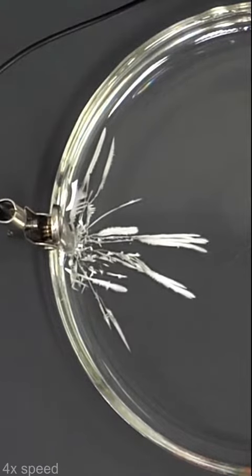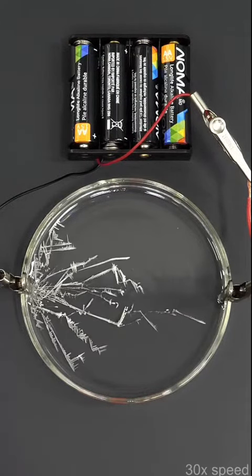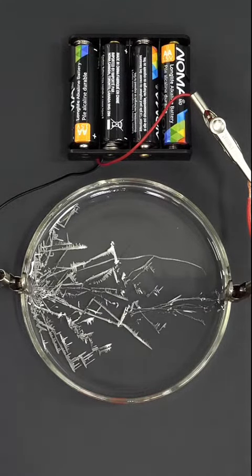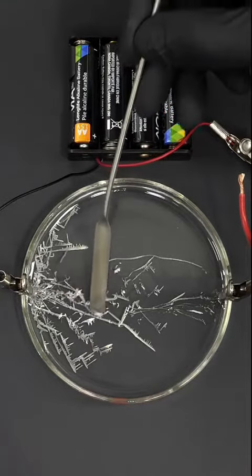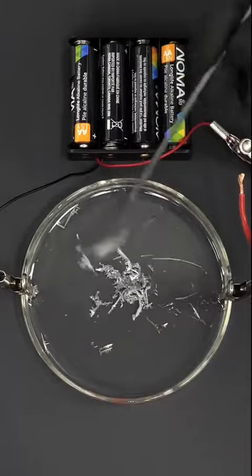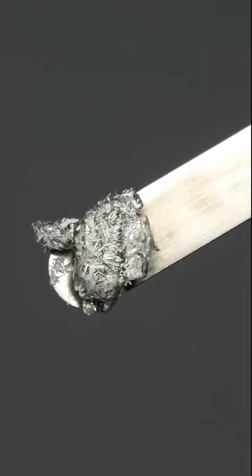This was happening because the batteries were giving electrons to the tin(II) chloride and turning it back into its metallic form. When it eventually made it to the other side, I disconnected it, and I poked at the crystals. All of this is actual metal, and I think that it's really cool that I made it using electricity.